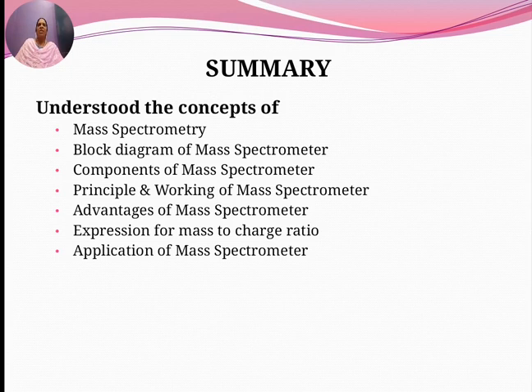The advantages of this mass spectrometer are: small size, small sample sizes are sufficient, fast scanning, they can differentiate isotopes, and they can be combined with gas and liquid chromatography to run mixtures. They can be used for insoluble samples and high mass compounds, they can handle high flow rates, they have very high accuracy, and they are less expensive.